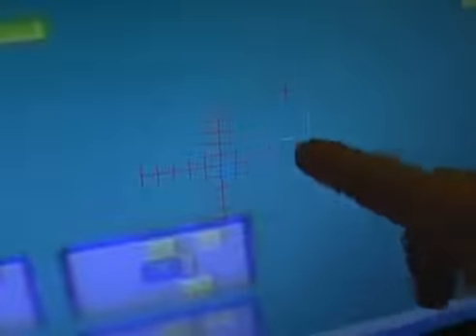And on the screen you can find a red cross, and this is to show where the tip will be touching your sample surface. Now to explain the calibration: we need to do a calibration for the tip position every time we use the machine. So we right click the mouse and do the stylus, the reticule, and align. It will automatically put the tip down onto the surface of the sample.